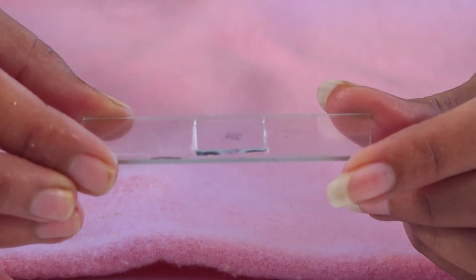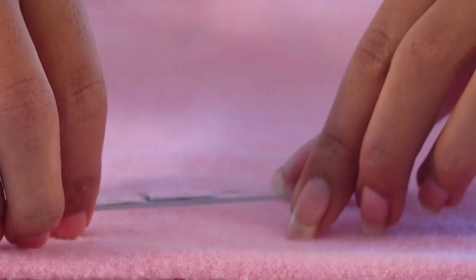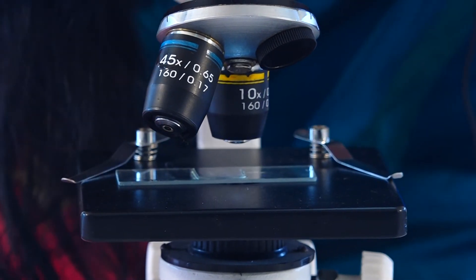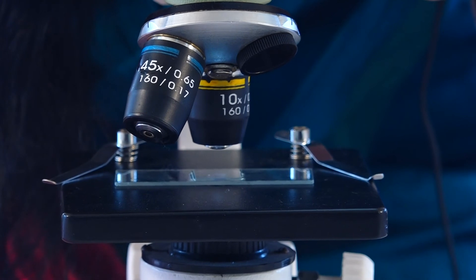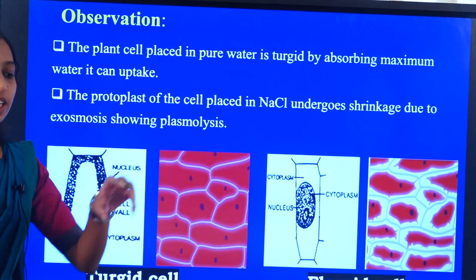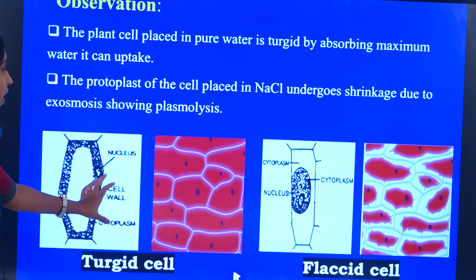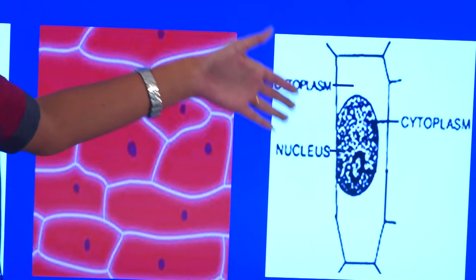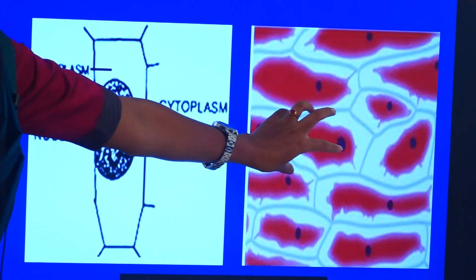Keep the prepared slide for a few minutes and then observe it under the microscope. After the absorption process, now microscopically we can observe the shrinkage of cytoplasmic content in the onion peel cells.